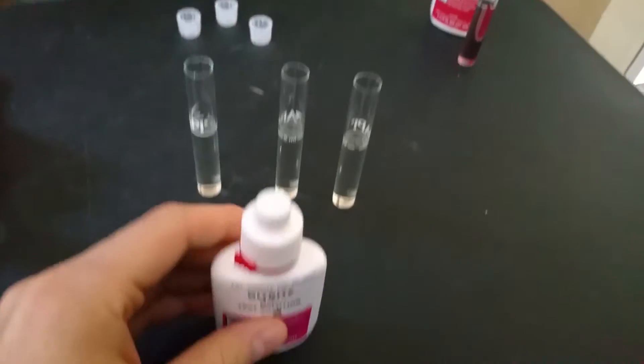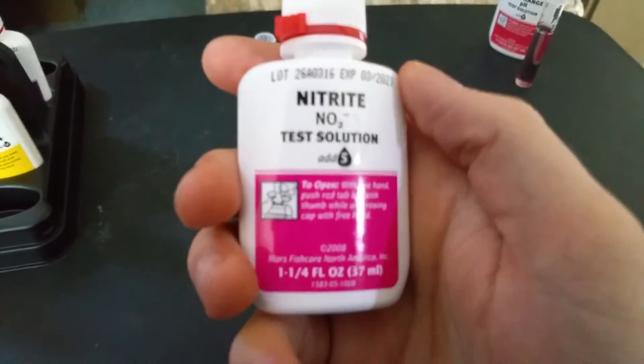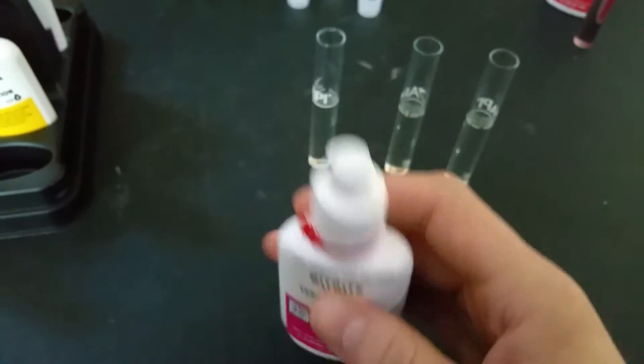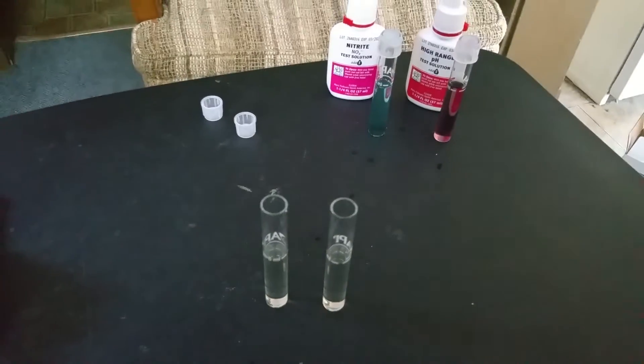Next we will do nitrite, which is the next easiest one. Give the bottle a few shakes before using it. This one also takes 5 drops. Put your top back on, and then shake the test tube for 5 seconds. Then place it next to the high range pH tube.